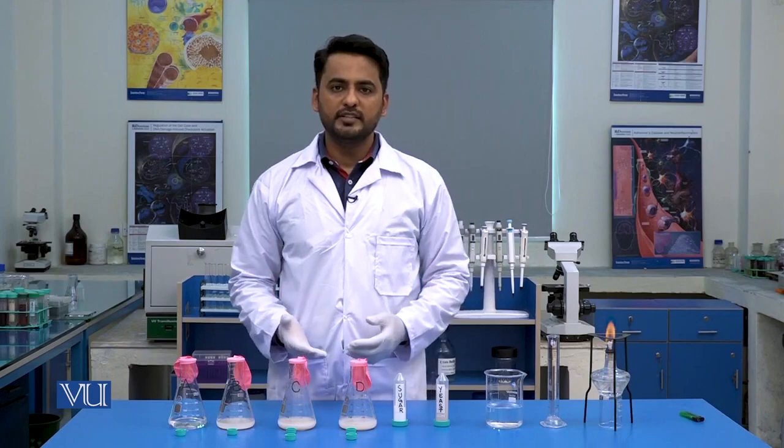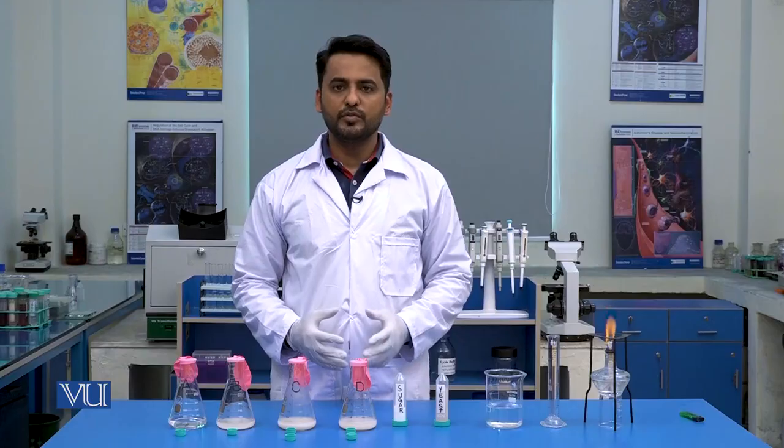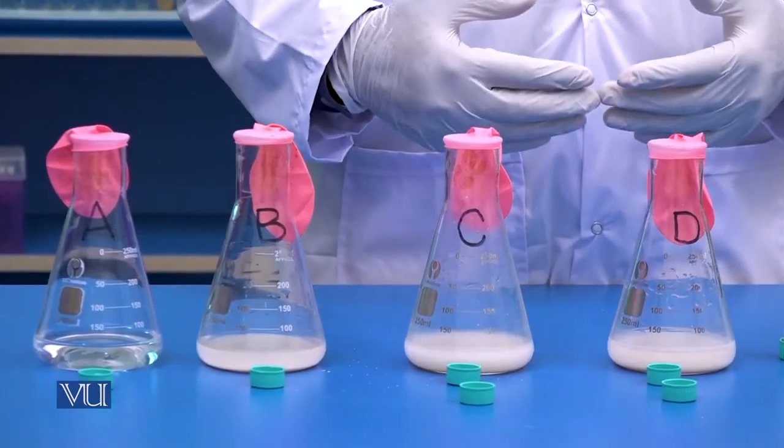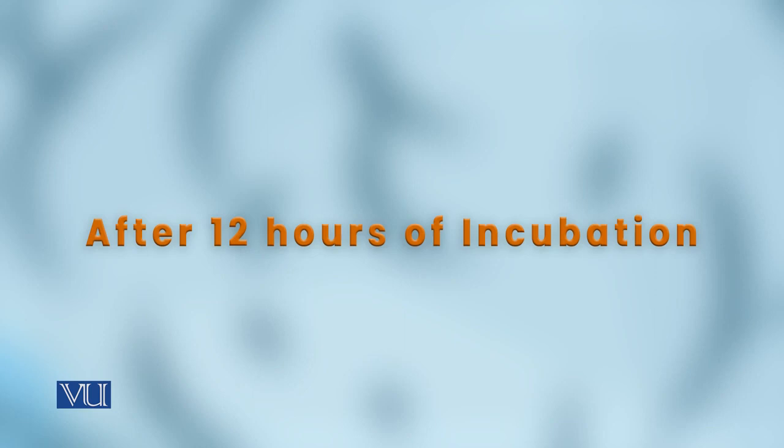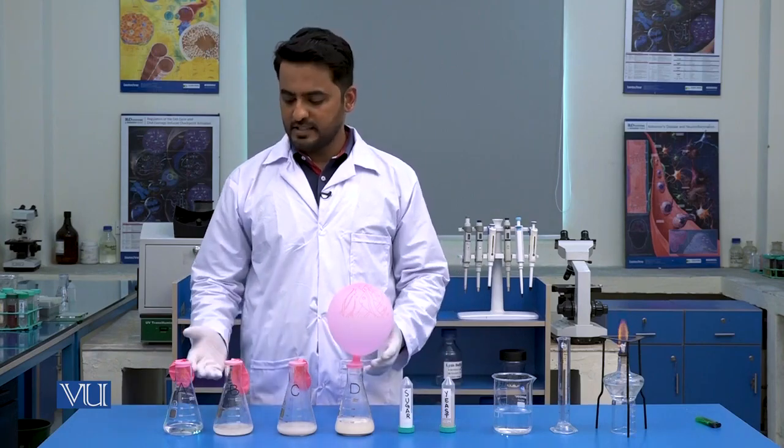Now after covering these flasks with the help of balloons, we will incubate these flasks for at least 12 to 24 hours so that the reaction can complete. So after passing 12 hours, we will have such a situation.